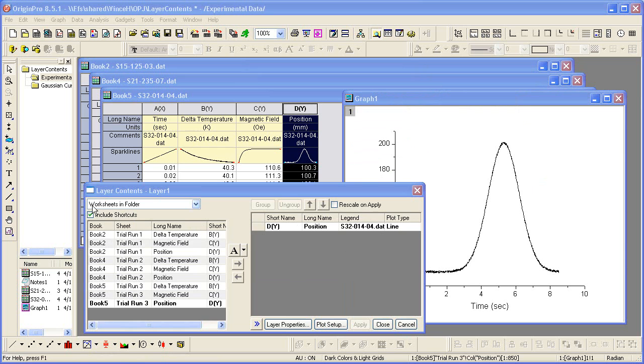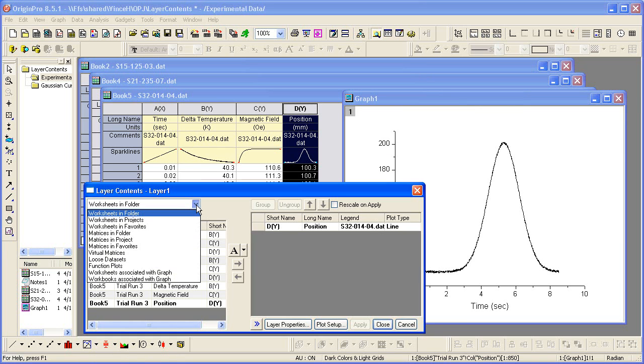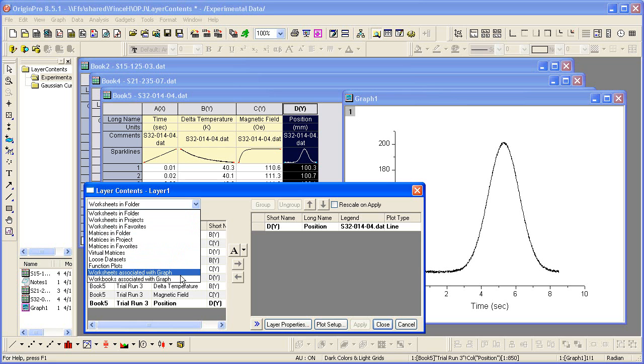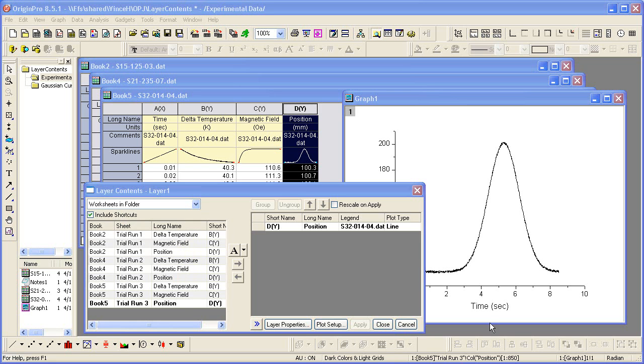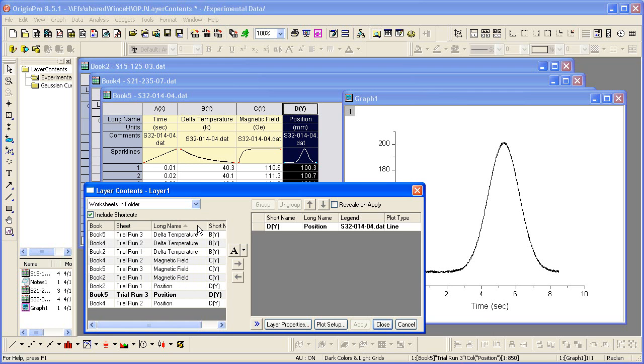In this case, I have worksheets and folders selected, but I can select from many other subsets in the drop-down list. Notice that I may sort the available data by any of the columns shown in the left panel. In this case, I will sort by long name so that I can see comparable datasets next to one another by name.